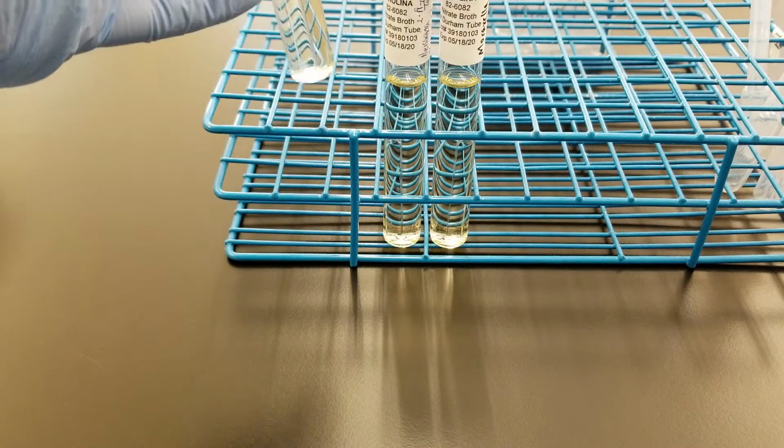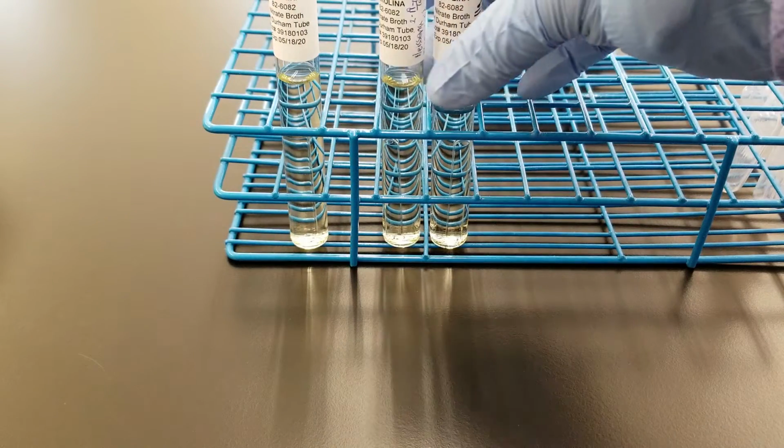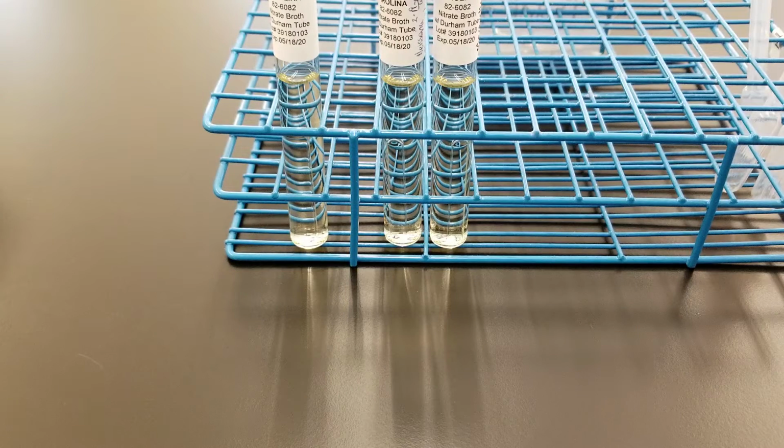So what we're going to do first is we're going to inoculate some tubes. We have two tubes here, one for Moraxella catarrhalis, the other for Neisseria meningitidis. You can use the nitrate reduction test on more than just the gram-negative cocci. We have gram-negative rods as well that we use in class, but currently we're in the first grouping of organisms, which includes Neisseria and Moraxella catarrhalis.